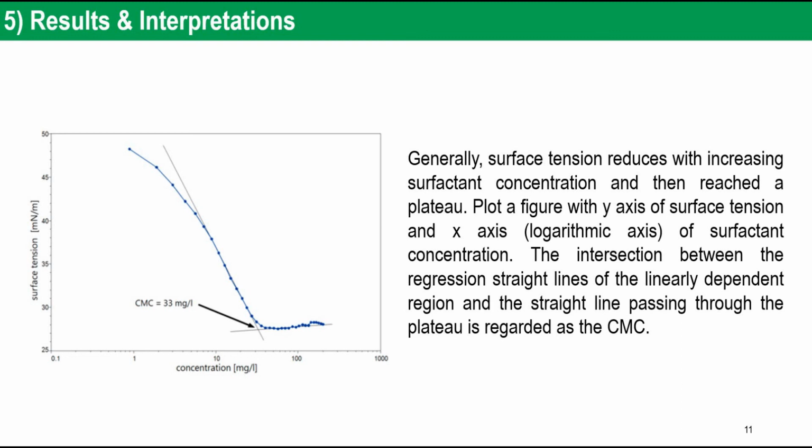As for task 2, students are asked to describe the changing trend of interfacial tension versus surfactant concentration, for example, in which surfactant concentration range the interfacial tension decreases very fast and then reaches a plateau, and at what concentration.